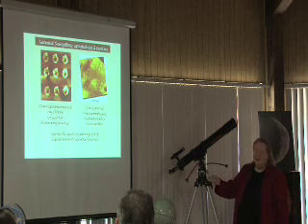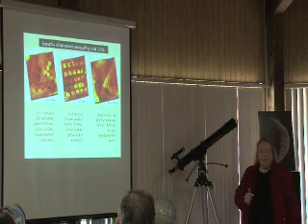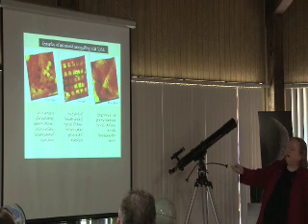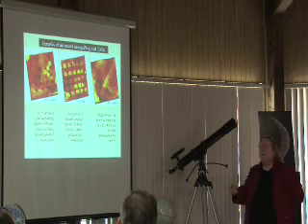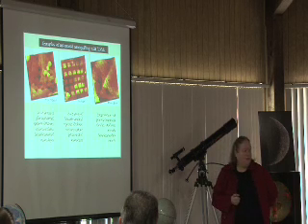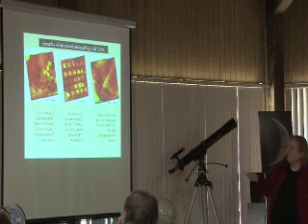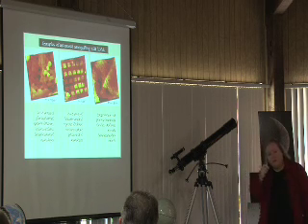So we're writing patterns with atomic force microscopy. Of course, if we can make circles, we can make squares. If the squares are bright, they're tall. If they're dark, they're shallow. So these are pictures of arrays of squares, and it takes us about 3 minutes to draw 15, 20, 25 patterns. These rings only took less than a minute to draw because we were just drawing a circle. About as fast as you could trace it with your finger, the AFM can write, because you're using a tip to write these patterns.